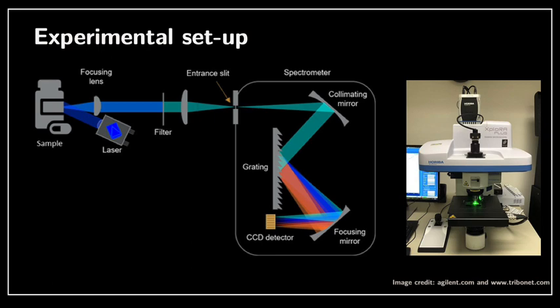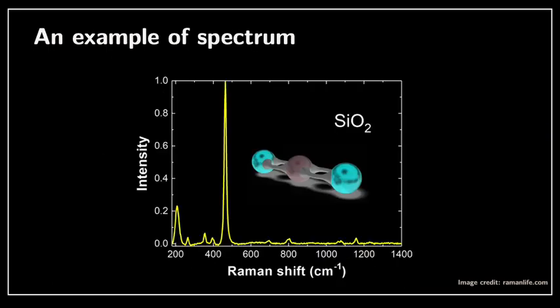So if you look at the Raman spectrum, I just picked here pretty much a random one. This is the spectrum of SiO2. When you look at the spectrum of Raman, you have such a plot, and the x-axis we usually call the Raman shift. I draw your attention to the fact that the units I usually use are centimeter-1. I'm going to discuss that in the next slide.